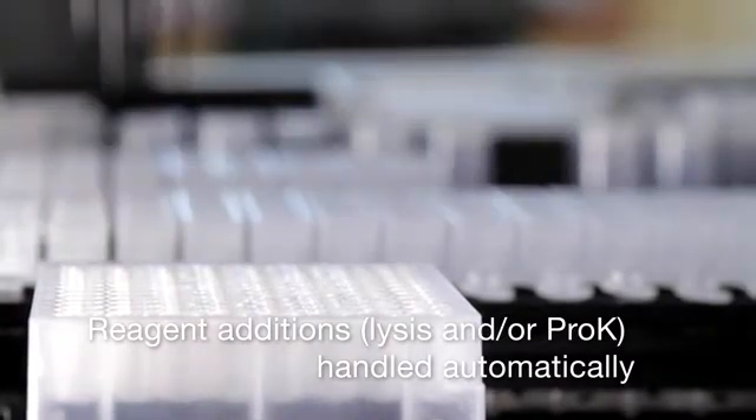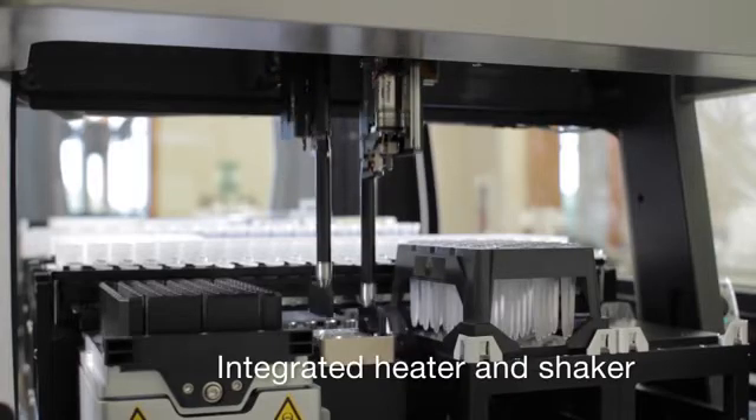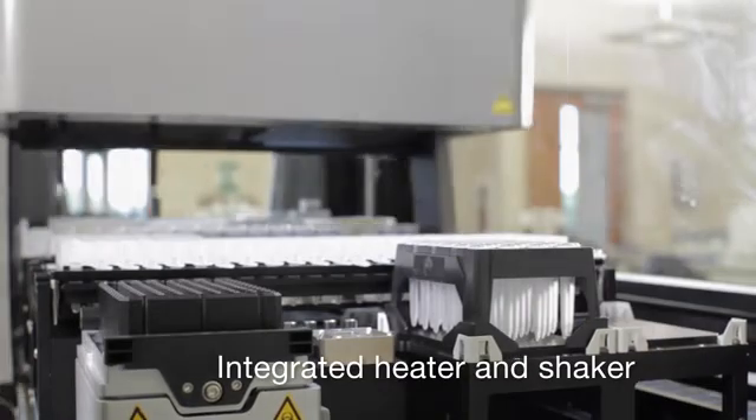The MaxPrep plate movement and integrated heating and shaking capabilities provide everything needed for the incubation steps with the Maxwell chemistries.